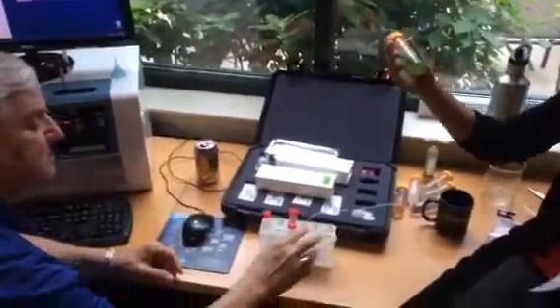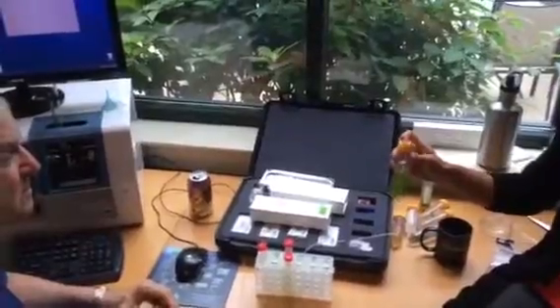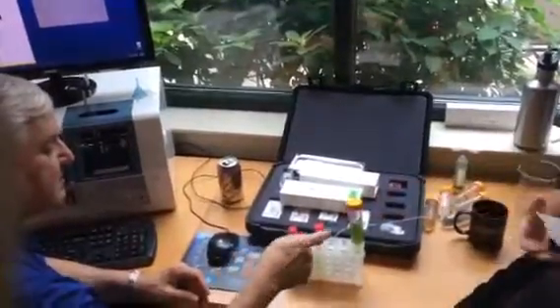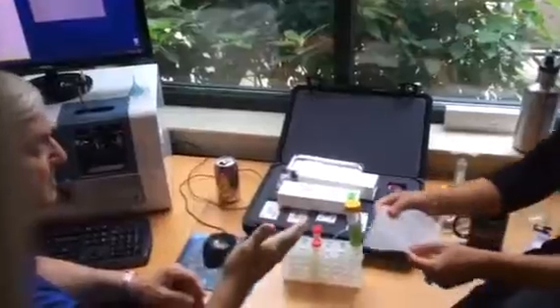Notice that when I get this sample ready, I'm not shaking it because I don't want there to be air bubbles in it. So, just give it a good turn. The reason I was shaking it hard is because it's clumped, and I was trying to break the clumps apart and get a little bit more, but there's plenty in there.